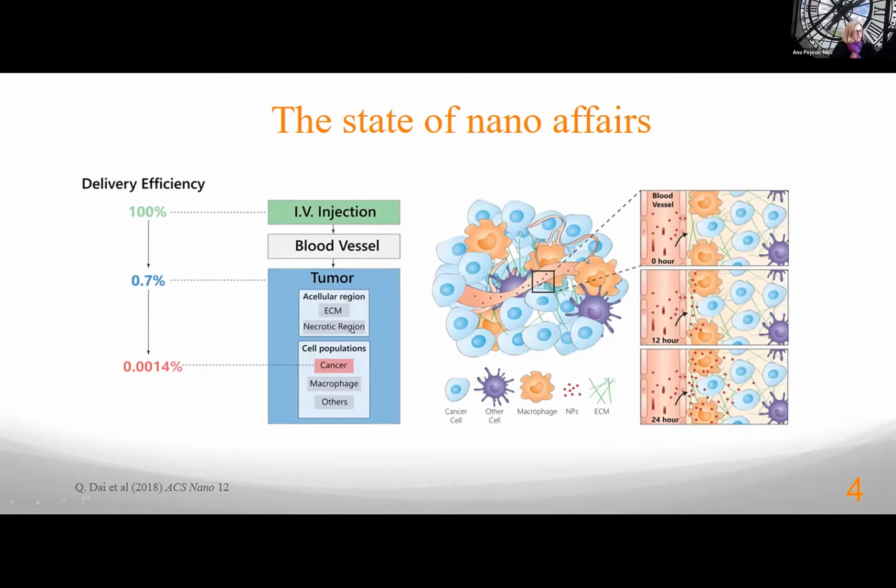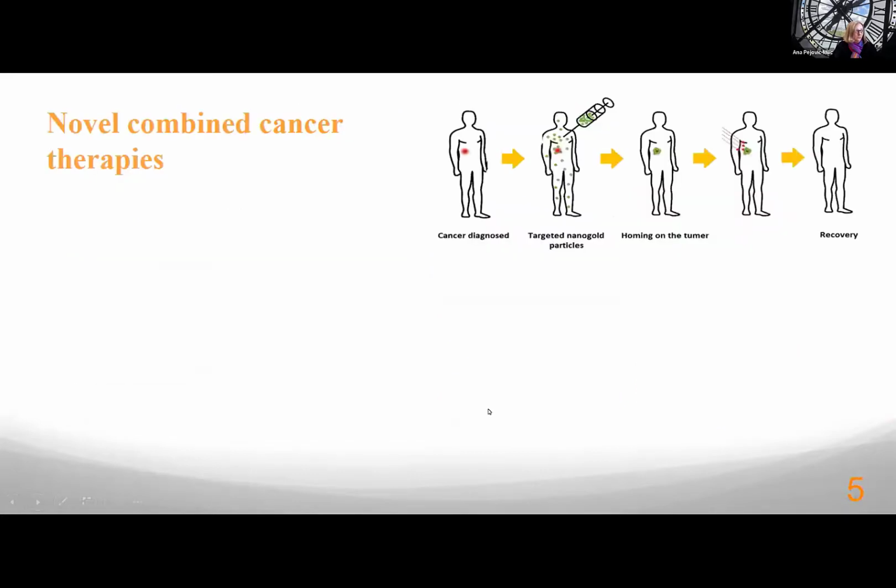So thank you, Natasha. I want to point out this very disappointing result, which pushes researchers in this community today to understand and improve the uptake. And it also really shows that they need a very accurate way of assessing the concentration of gold.